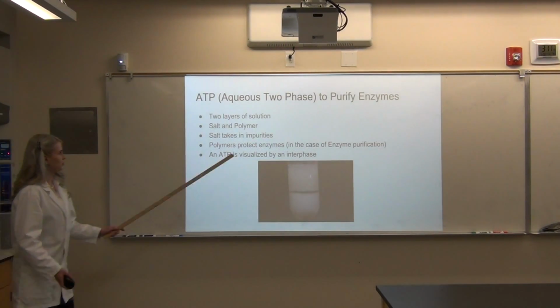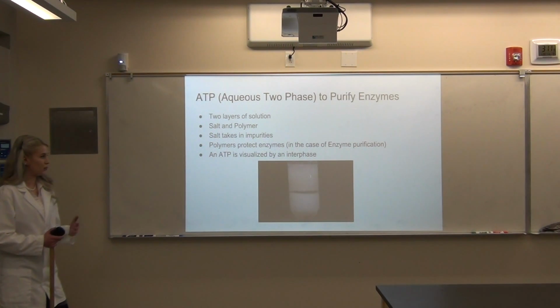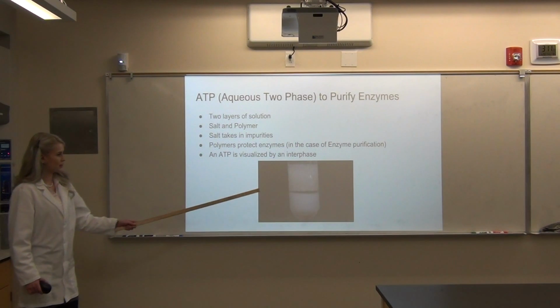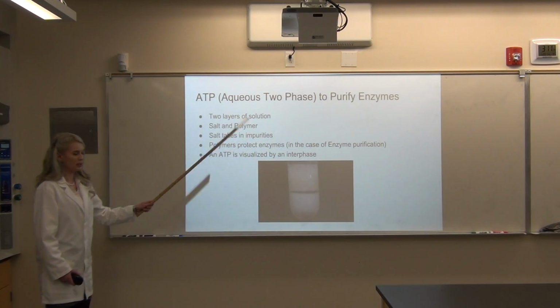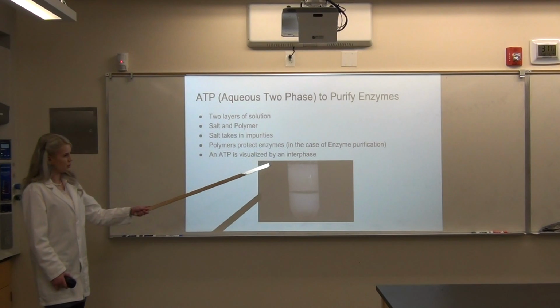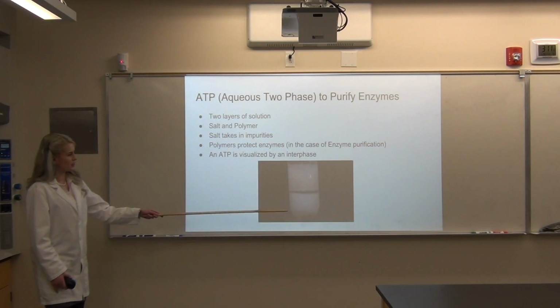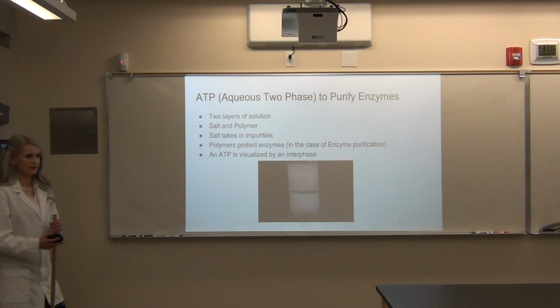So here's a picture of an aqueous two-phase. That's when you have two solutions that dissolve in water, but when added together become immiscible, which you can see by this interface right here. They want to separate. So in our research, we're hoping that with diffusion, we can separate and isolate the ADH into one of the layers.